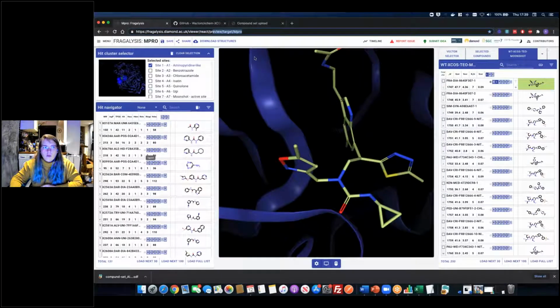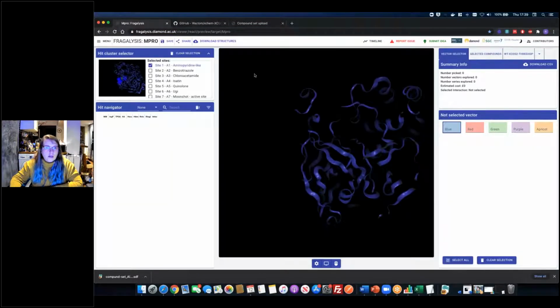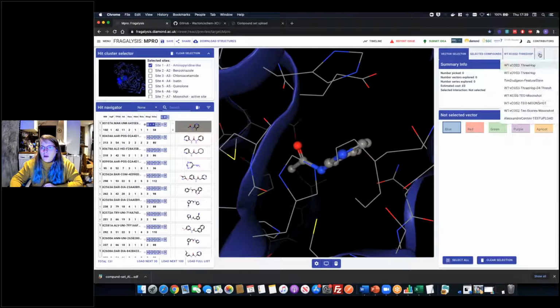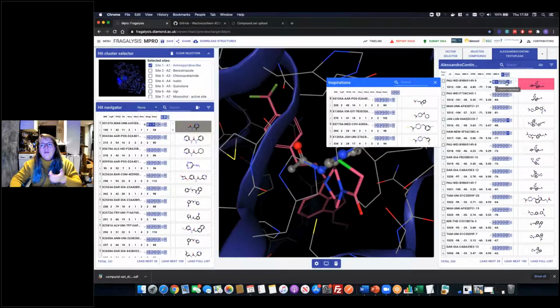So now if I refresh the page, I think we need to reload it to access the data. And it should be called something test upload. Yep, there we go. So that's the upload we've just done. We can go there and see those molecules we've just uploaded, and now it works.